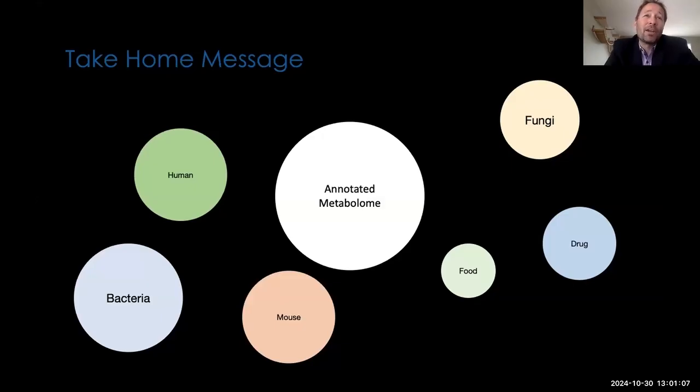And once you have enough data, I suspect there are going to be some really good machine learning strategies, as opposed to the brute force approach of spectral matching we use now, to be able to assign the food composition based on matches to clinical samples.